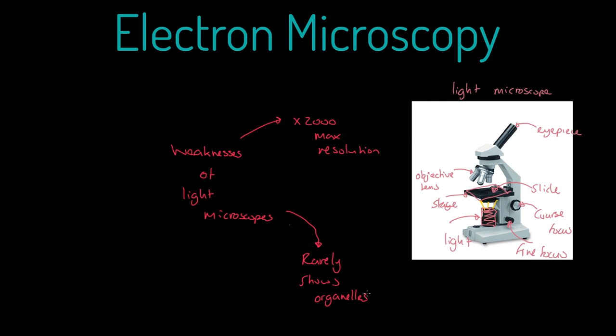Think about, for example, ribosomes within eukaryotic cells. These are things that we're going to struggle to see, well, we're just not going to see with this type of light microscope. And the thing I'd say to you is that the school ones, the ones that you're probably used to using, you may have some different quality there, but it's going to be some kind of times 100 resolution.